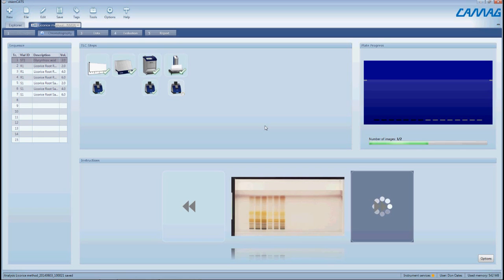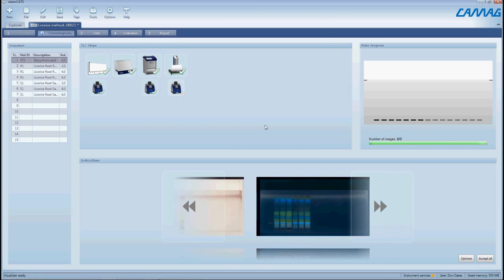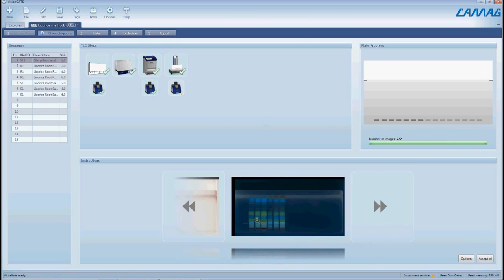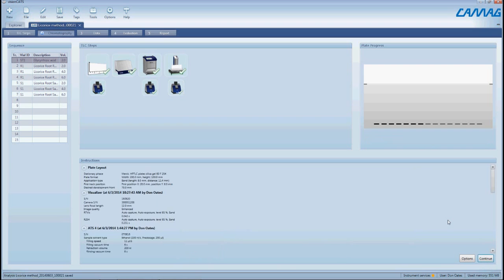Right now we're doing the 366 image and there we are, and as you can see it looks quite different than before. So we're happy with these, we just say accept all and now we are finished. At this point we can move on to the next step which would be to look at the data and evaluate the images.